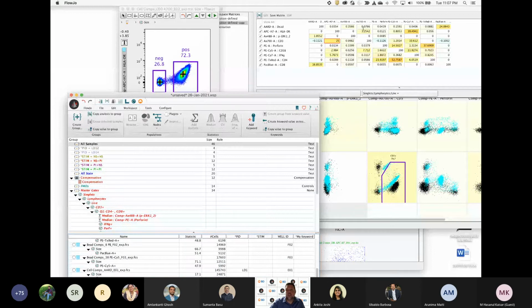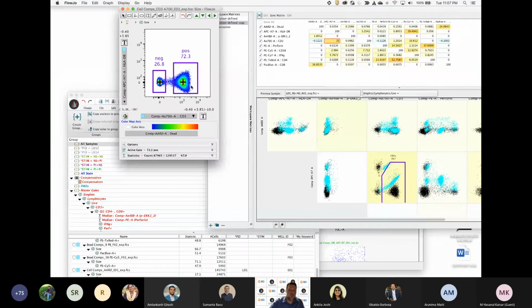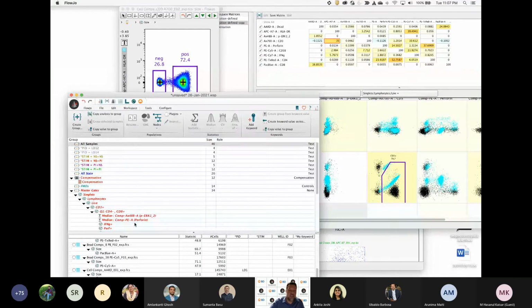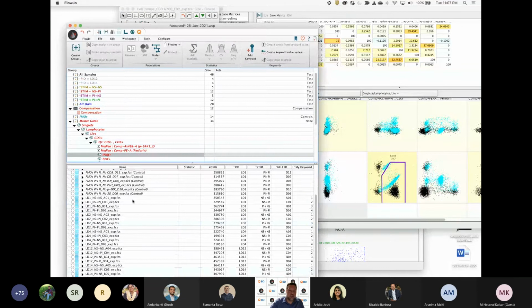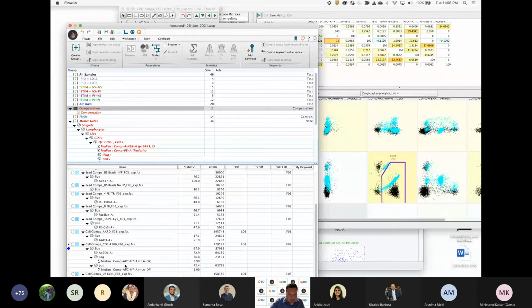And so when I start to mess with a matrix, I often recommend you use a visual dot plot as well and gate on positive and negative and make that statistical calculation and try and match the medians on your comp control right here. So there, I hit it perfectly with my 35. I knew 35 was the right number, right? 2.9 to 2.9. That's a correct compensation interaction.